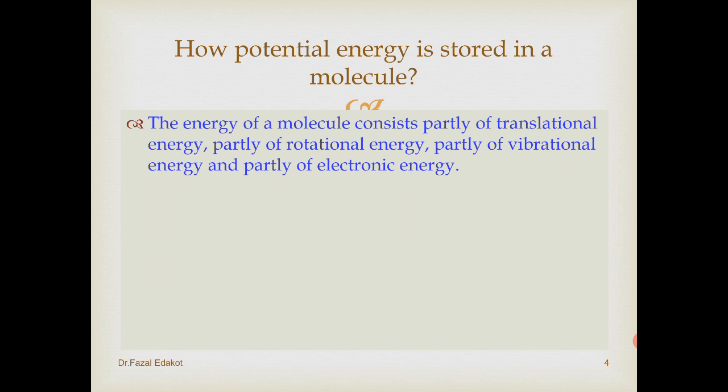They have the capacity to absorb energy. They absorb energy in order to move from a lower energy to a higher energy. All this vibration, everything will be happening. If they absorb energy, they will go to a higher energy level.